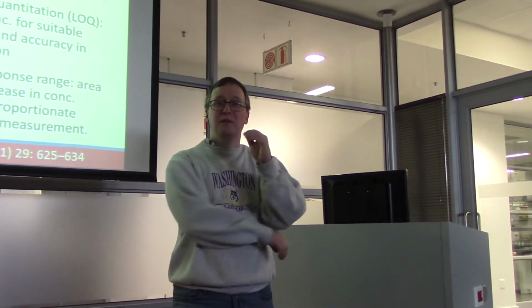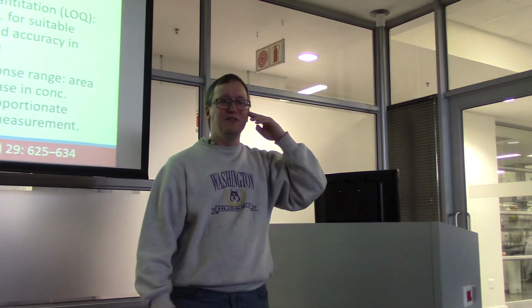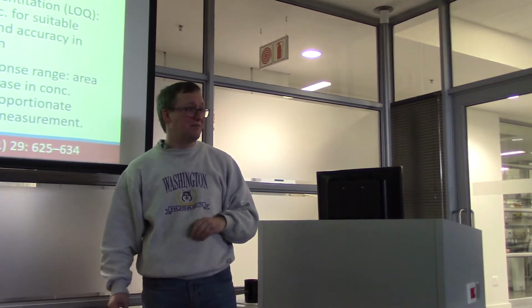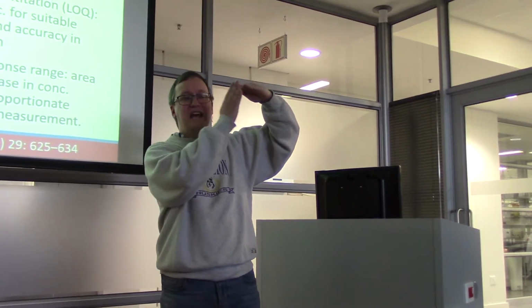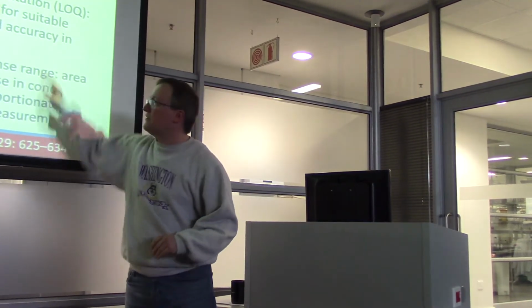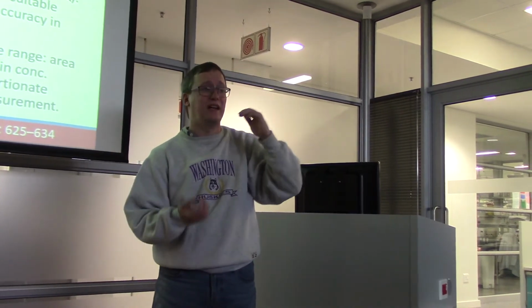This is a problem because our ears, like lots of other detectors, have some limit above which they don't really go very effectively. And even if the sound level is doubled in intensity, to us it all just sounds like a big blat. Well, mass spec detectors are very much the same. If you have too much of the sample there, you're not going to be able to detect that its level goes up or down because all the instrument hears is blat. So this limit of quantitation has both a lower bound and an upper bound, and we need to be able to figure out where that is to be able to quantify effectively.